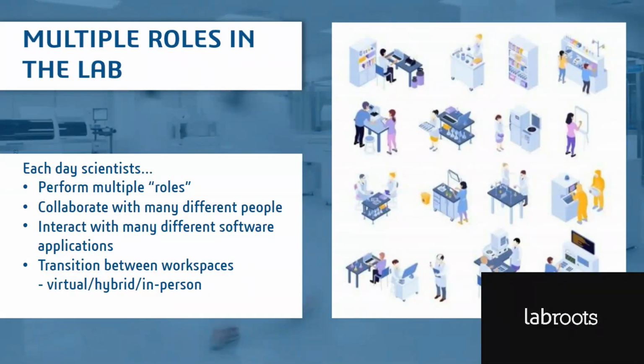I want to focus on lab scientists for a moment because too often we talk about lab informatics in terms of workflows and efficiencies, and that leads us to kind of forget the human factor as well. A scientist that's working in the lab has to move between many different systems to complete their routine work. Our lab systems have to serve different roles and personas across the organization, but we also have to consider that scientists perform many different roles in their daily lives.